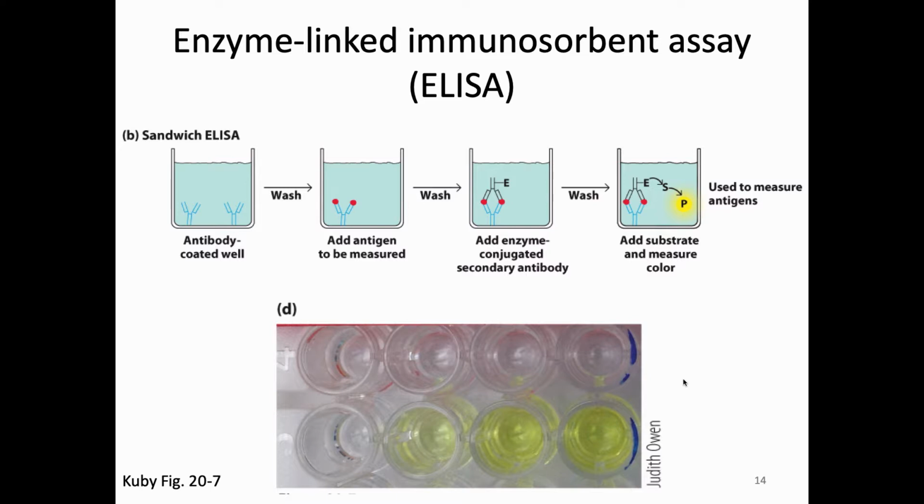We can then use another antibody that can bind to that same antigen, and it will also be trapped there. If there had been no antigen binding, there would be nothing to trap this antibody, this detection antibody, and so it would not stick. There are wash steps between all of these. And then you can detect this either because of something like an enzyme labeled E that can convert a product, or you can have a secondary, just like you had in the other ones as well. And so you can see there was no antigen, so we got no color change because this antibody didn't stick and make our substrate change color.